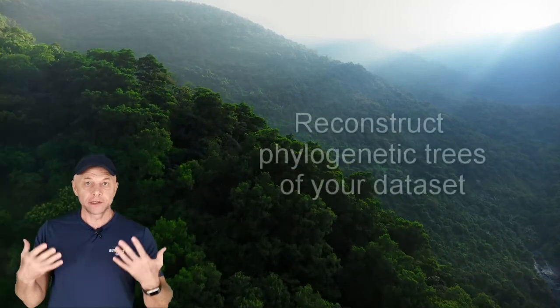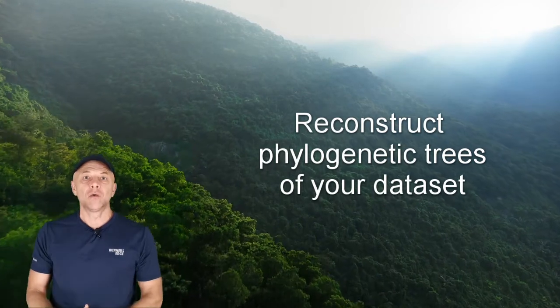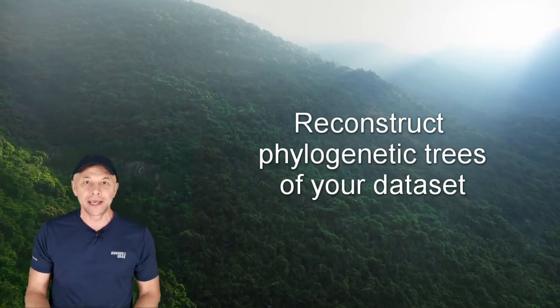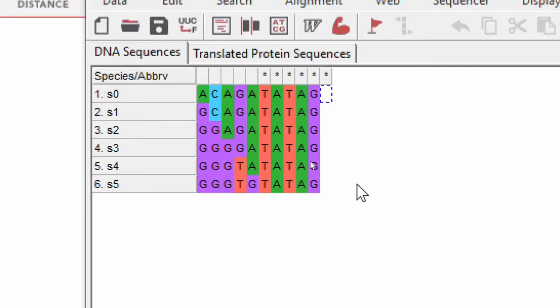Welcome to part 2 of the lecture. In this part, I'm going to introduce you to MEGA software. Using the MEGA software, you can analyze your own data which you generated in the previous part, playing the mutational board game. To explain some basic principles of phylogenetics, and in particular the use of the program MEGA, I created a test data set.